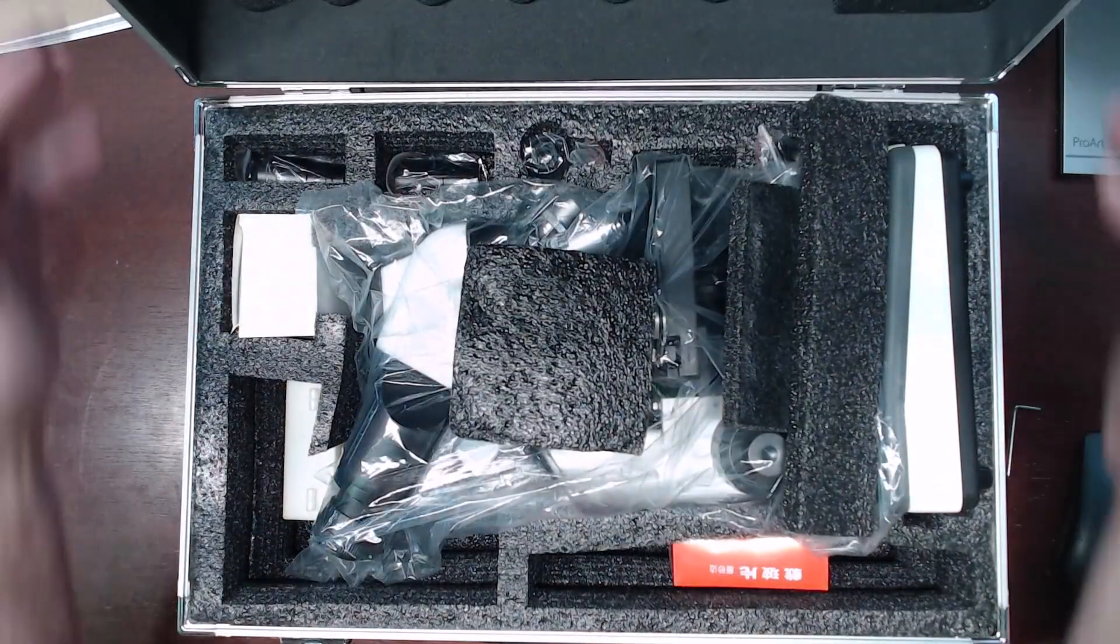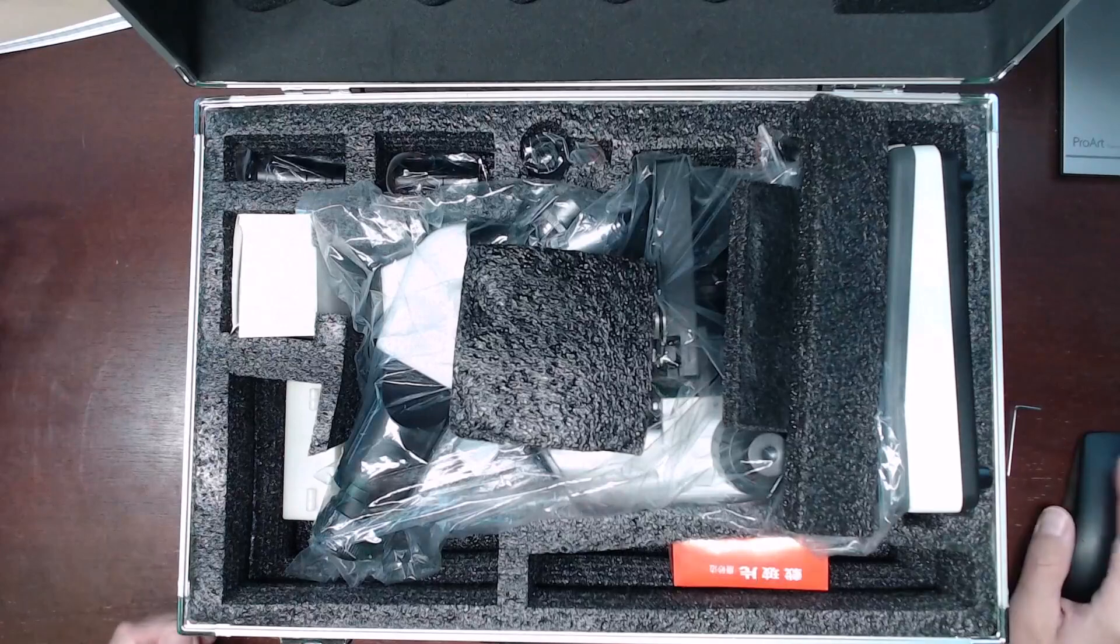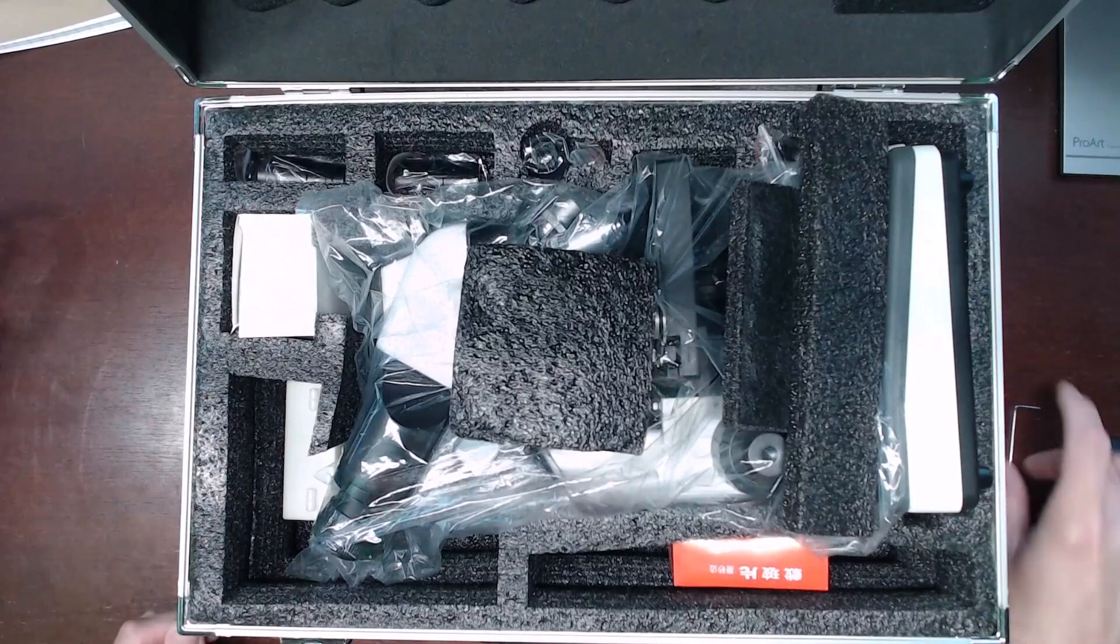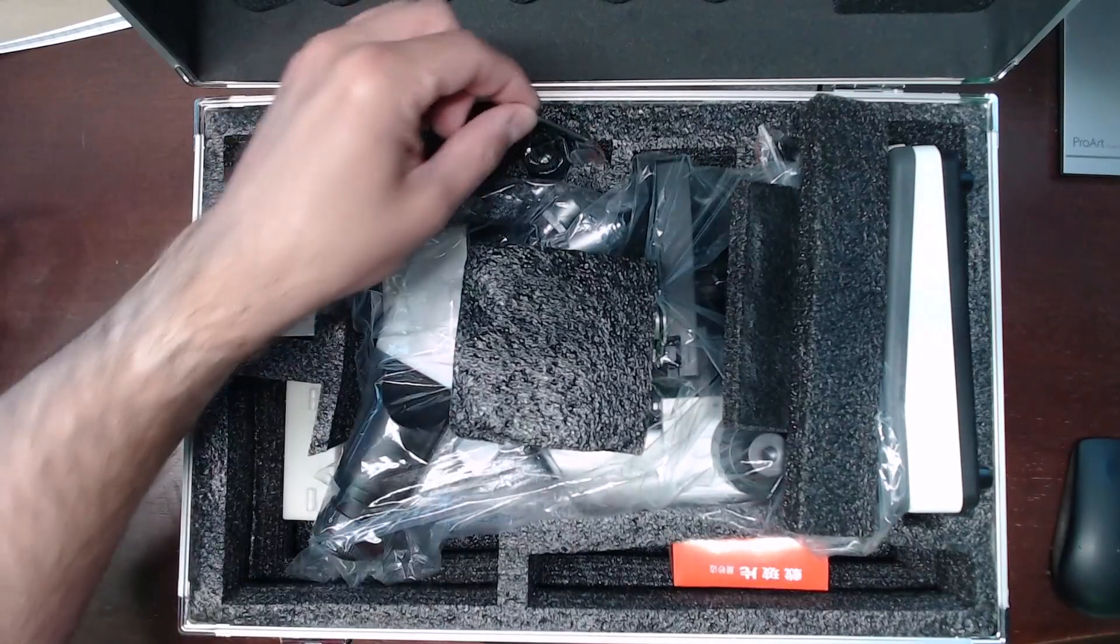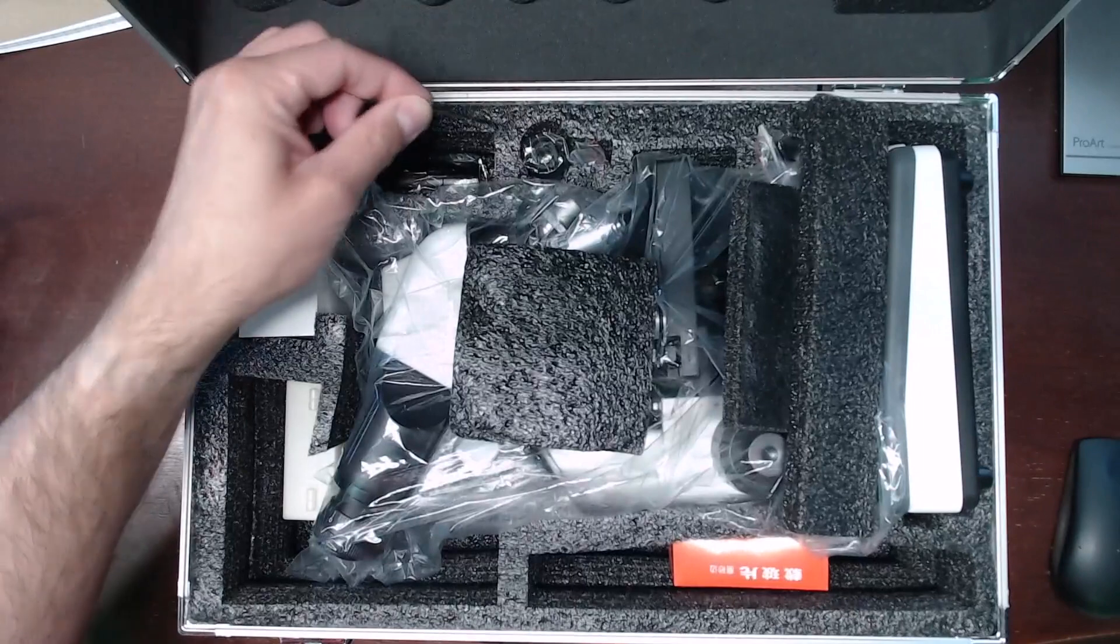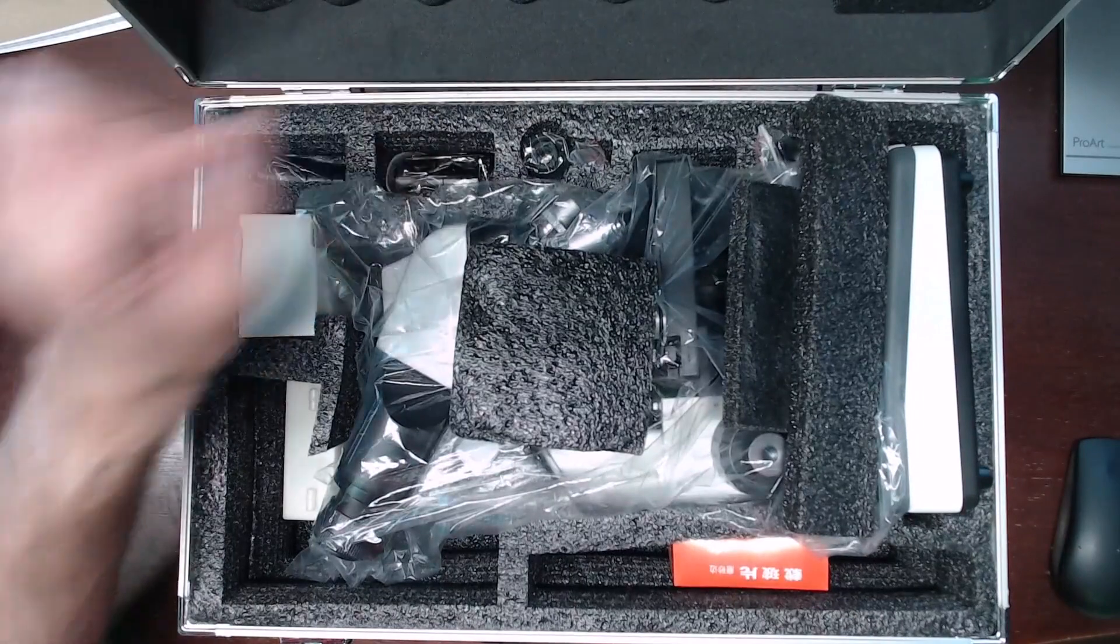At first it feels a little bit flimsy, but then it seems okay and does have some good padding on the inside to cradle the microscope and accessories.